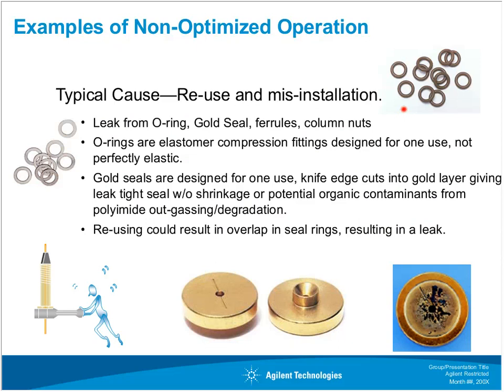Hopefully you're not seeing residues in your liner, but that doesn't mean that they're not there. If you can see them, that's an extreme case. And I would say that more than likely you've let the issue go a little bit too far before addressing it, and so now we've got to dig into the system a little bit more. Get in there, change the gold seals and things like that, whereas maybe we could have just replaced the liner a little bit more frequently.